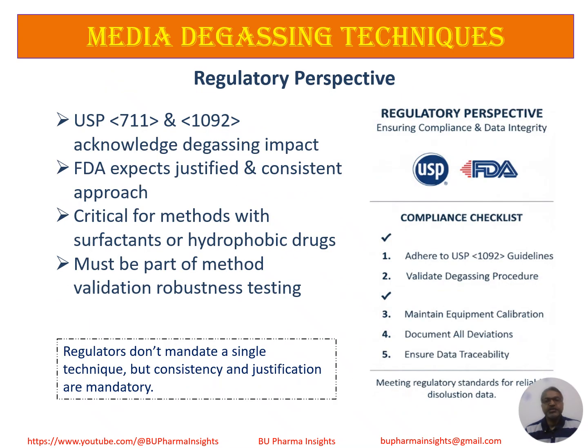During method validation, you must demonstrate that media preparation, including degassing, does not affect dissolution results. If dissolved oxygen is part of the approved method, DO values must be documented and controlled. Regulators do not mandate a single degassing technique, but consistency and scientific justification are mandatory.